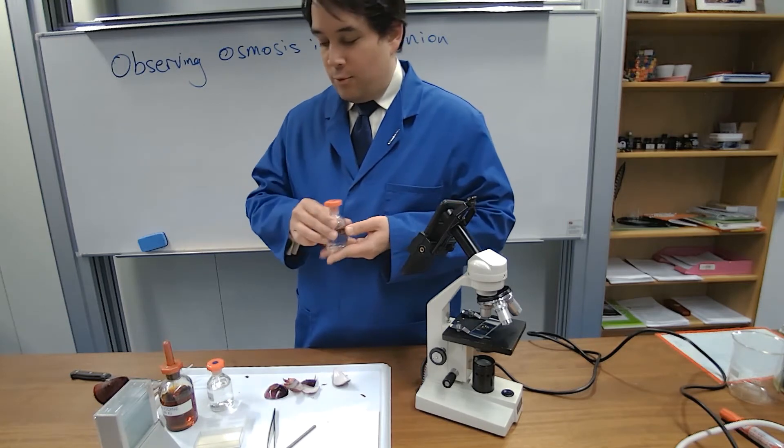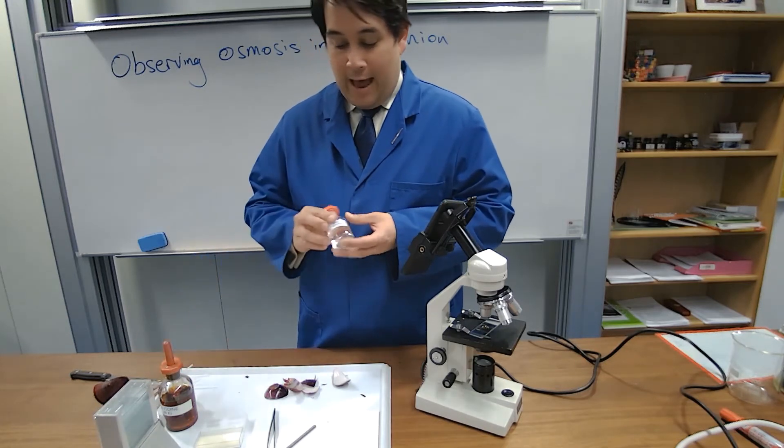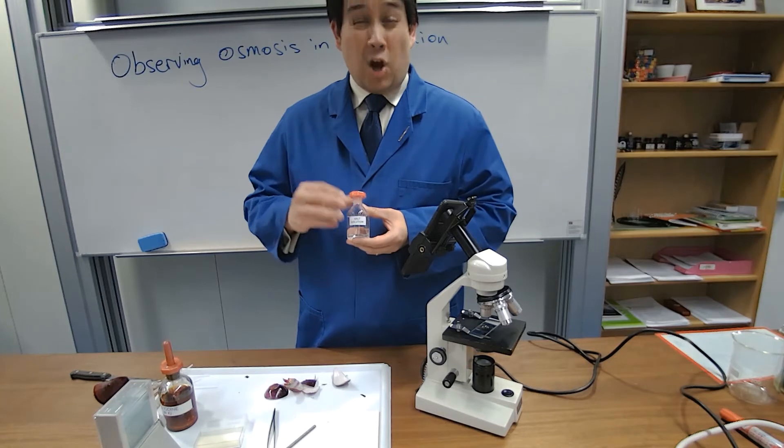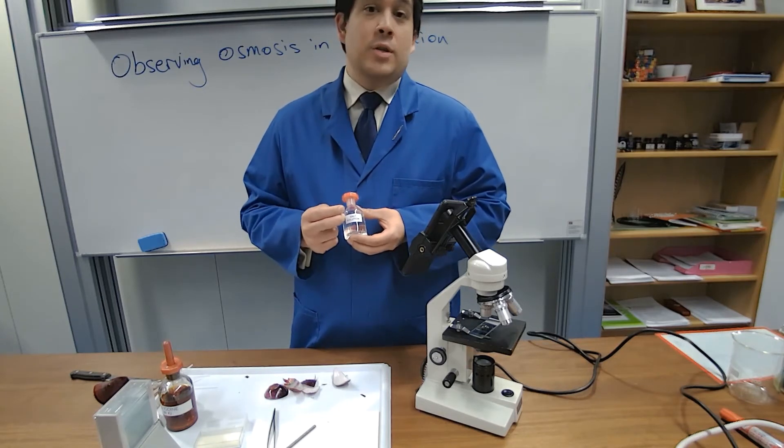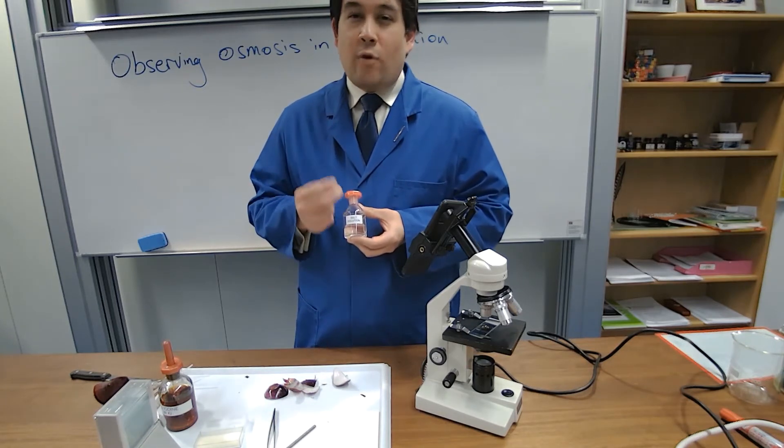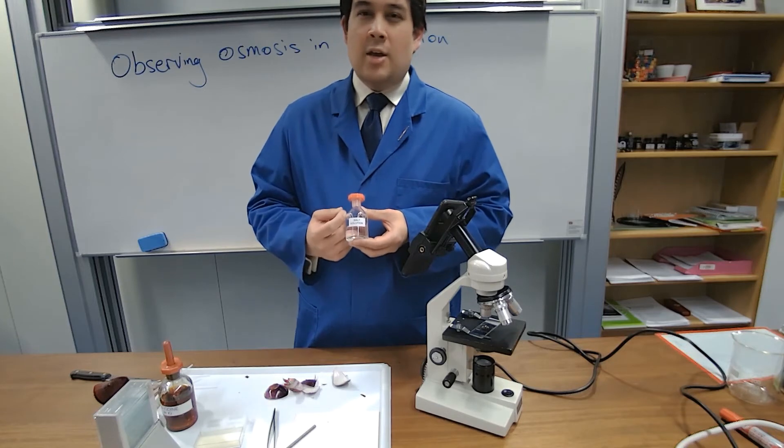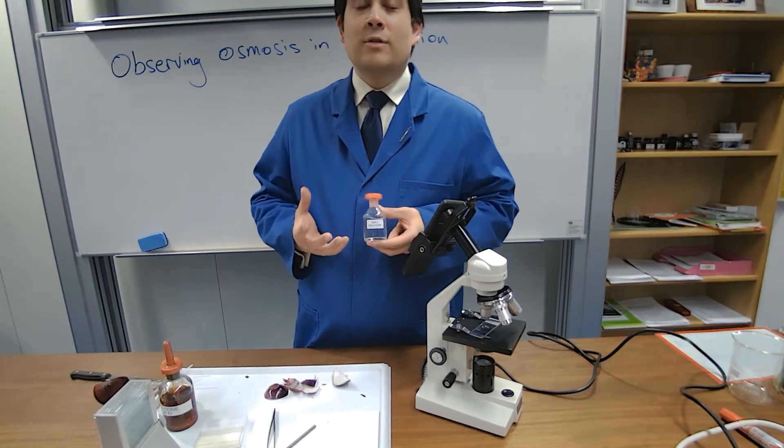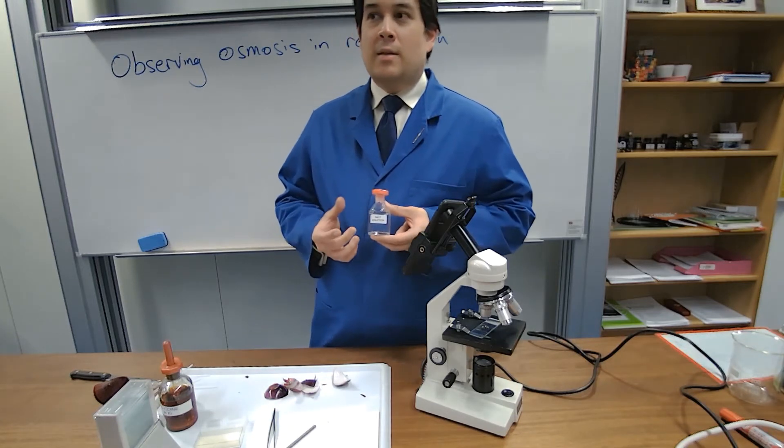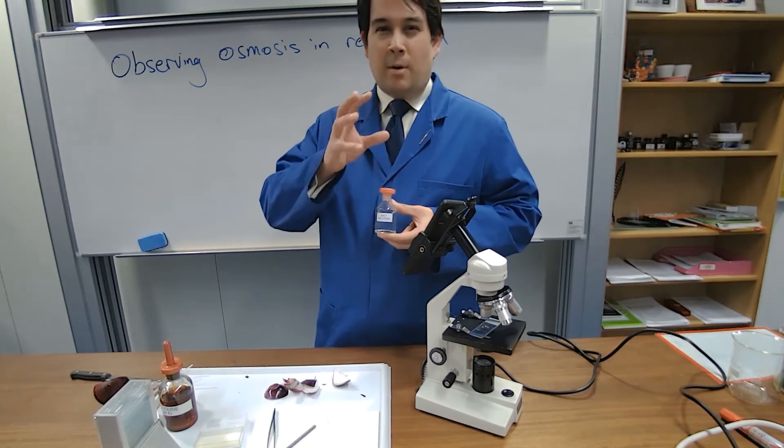After that, we're going to dab away the water. We're then going to add some really strong, concentrated salt solution. This is hypertonic, and therefore it should draw water out of the cells by osmosis. Then we should be able to see plasmolysis occurring.